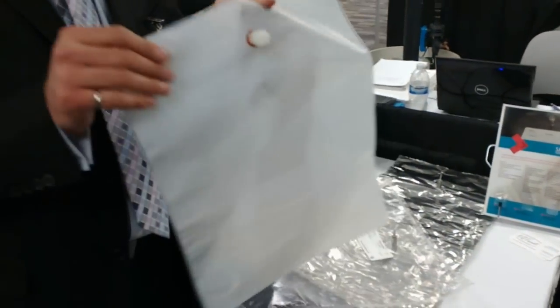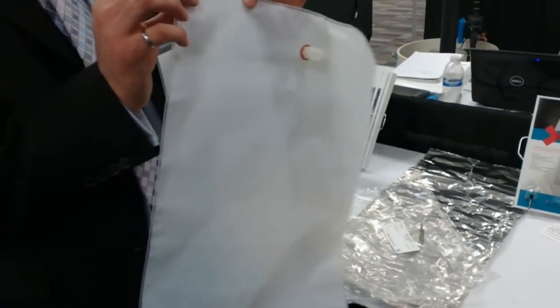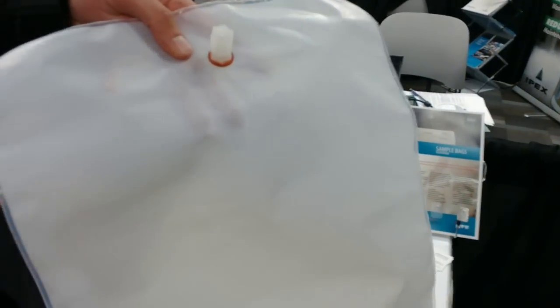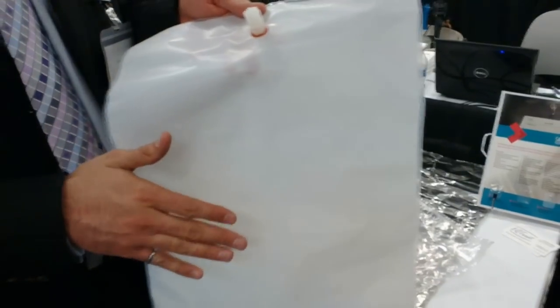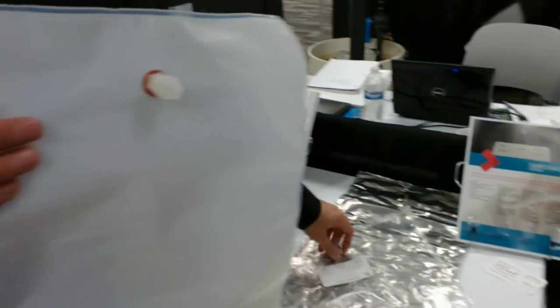So we came up with this bag — it's pure Teflon. There's nothing in it, it's just Teflon. It's a little bit thicker than usual to make sure that odors don't go out. Odors don't stick to it — we can't even put a sticker on it like we can on other bags. It won't stick, it just goes off.